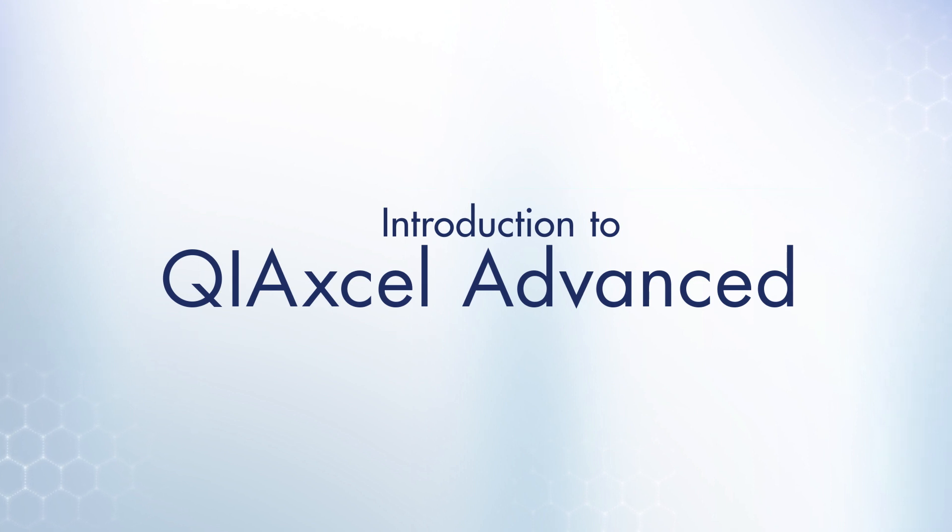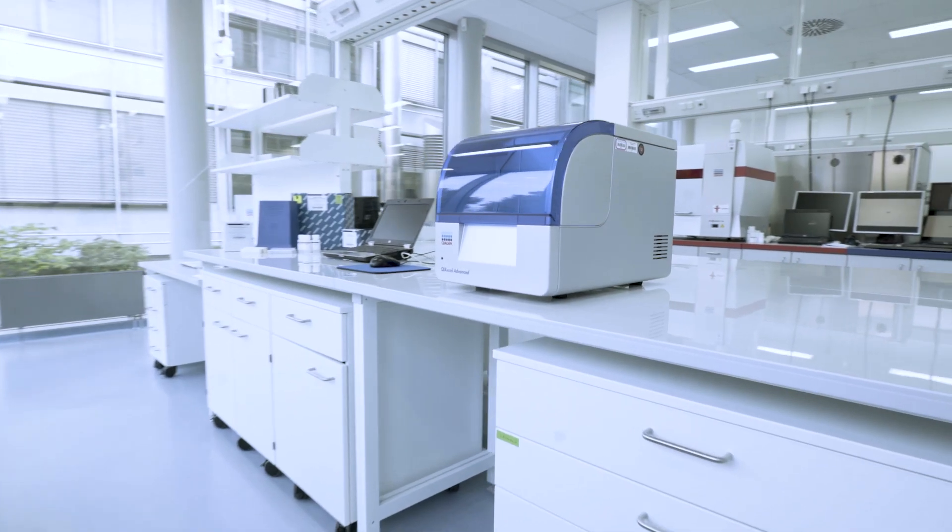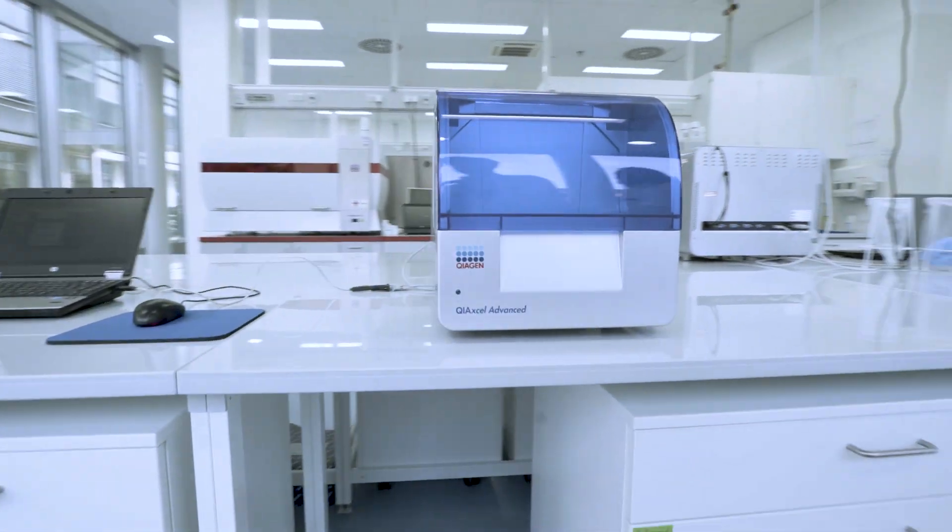QIAxcel Advanced: an introduction to fully automated capillary electrophoresis. This is the QIAxcel Advanced.